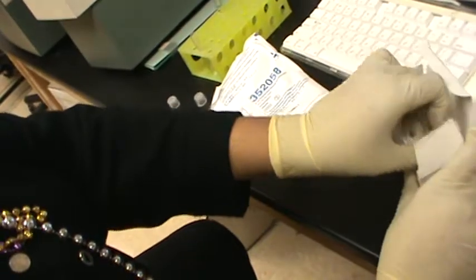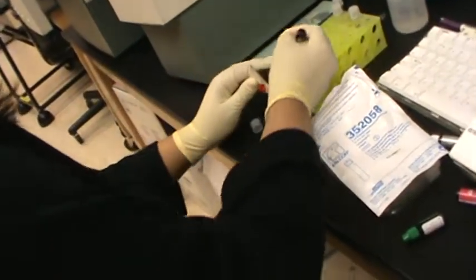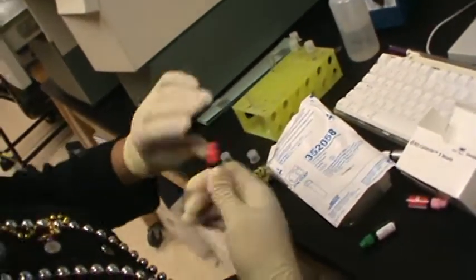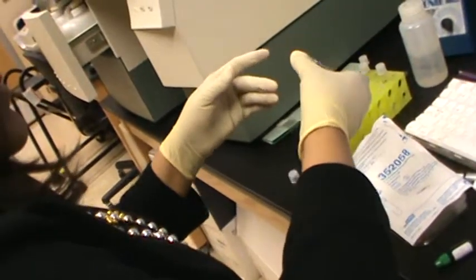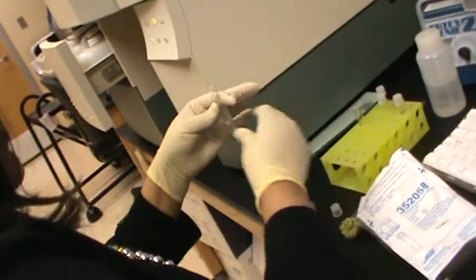And then the last one. Mix this one up. You remove and just make sure your mix tube is ready.